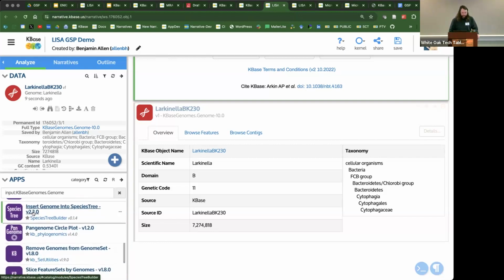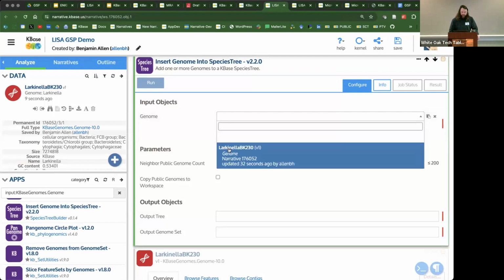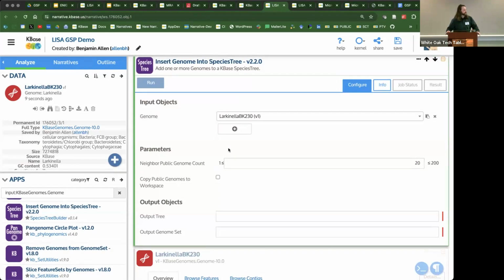And so you can see that this is a very rapid way to start building out and sharing your analysis in a collaborative way, and allows for continued use of all of the genomes that are being produced today, because as we know, there are thousands and thousands and thousands of new microorganism genomes that come online all the time. We hope that this will actually enable the research community to dive deeper into what's inside of those genomes.